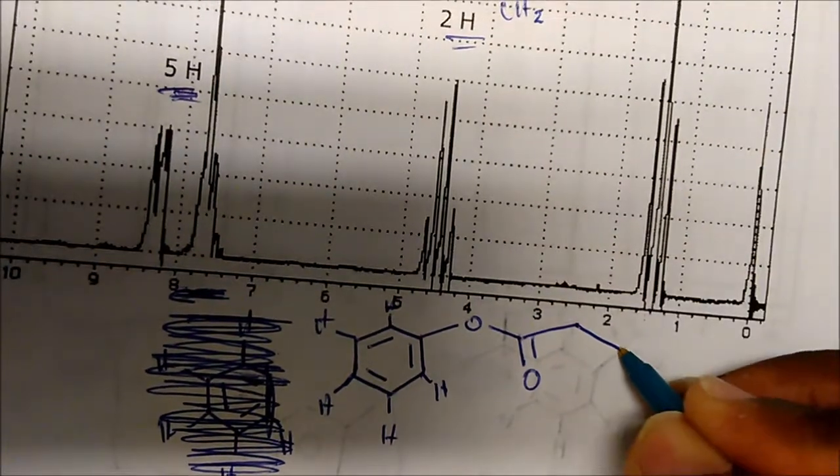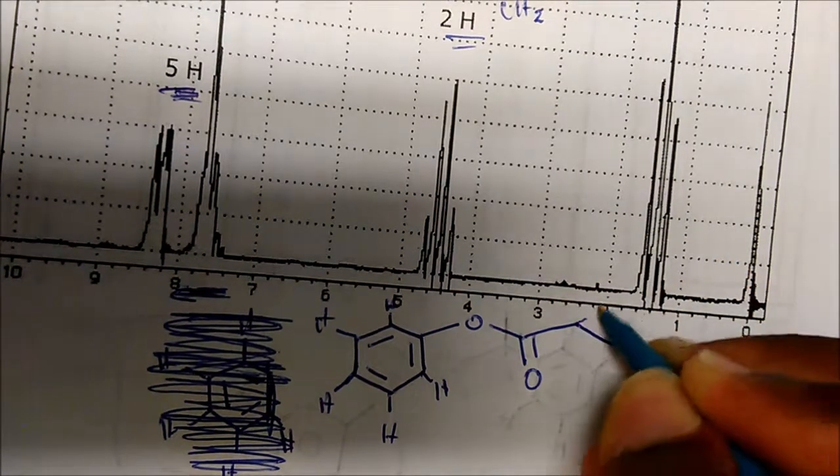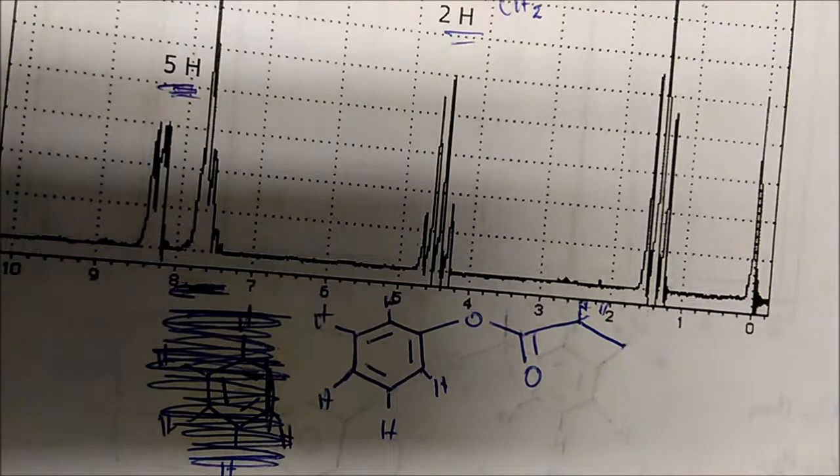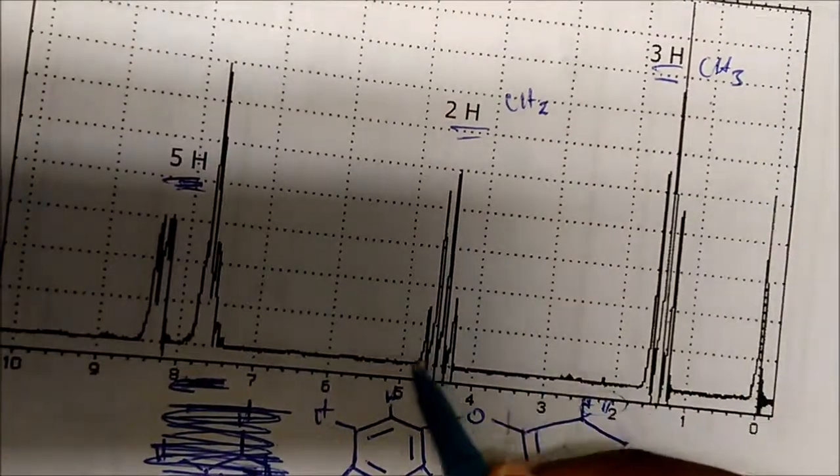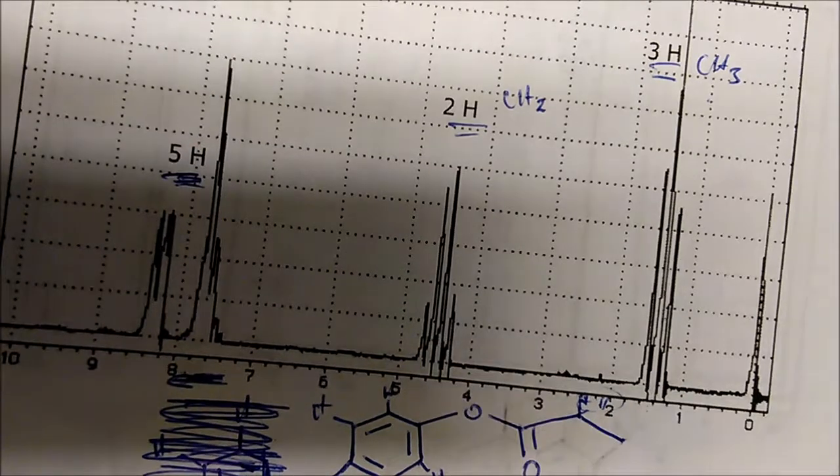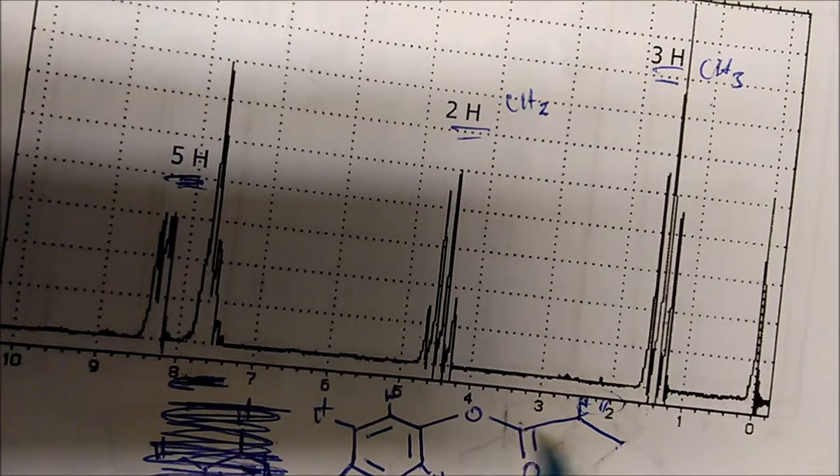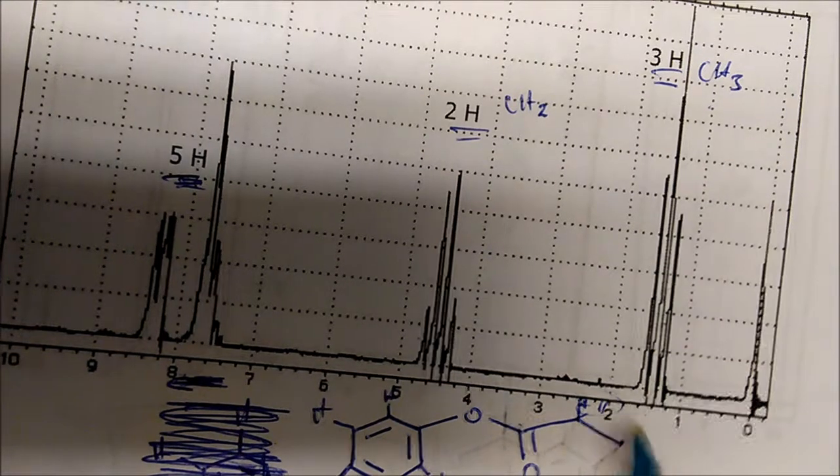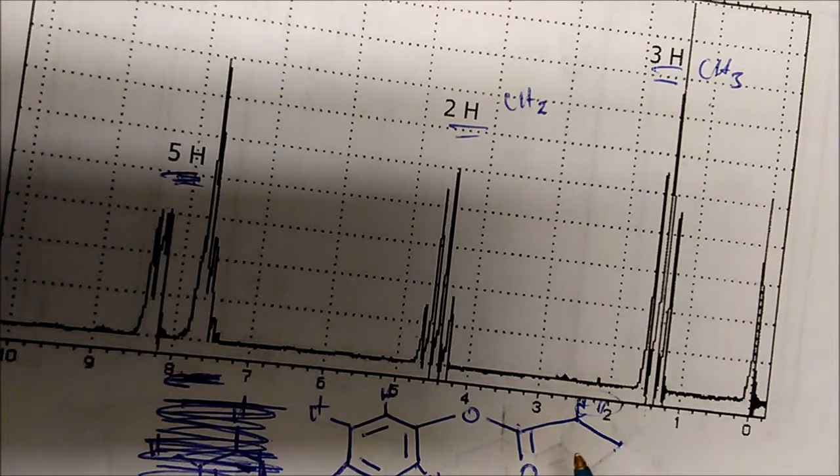Again, we have a CH3 here that splits one, two, three times. So therefore, it only has to have two neighbors - one, two protons. These CH2 here splits how many times? One, two, three, four. Well, how many neighbors does it have? It doesn't have any neighbors here, but it has three here. So three plus one is four. And indeed, we see a quartet here. So indeed, this is the structural formula for the molecule.